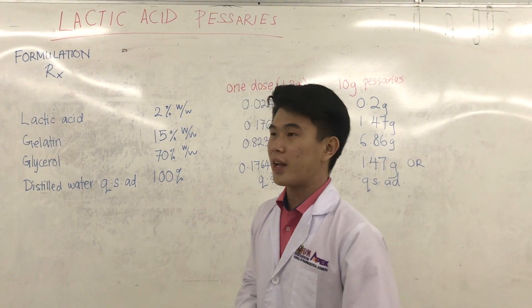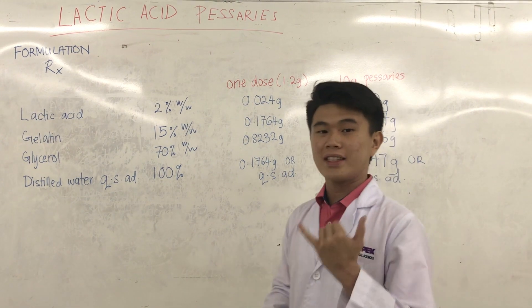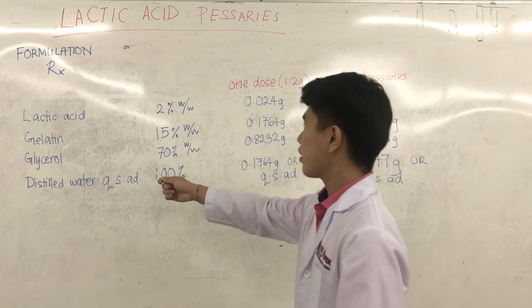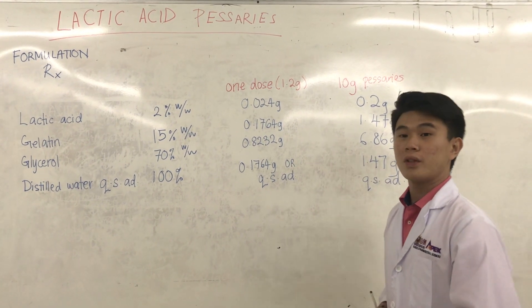So we are going to formulate 10g pessaries, and eventually we are going to dispense 6 pessaries. This is what we have calculated, and this is the measurement that we need. So without further ado, let's get started.